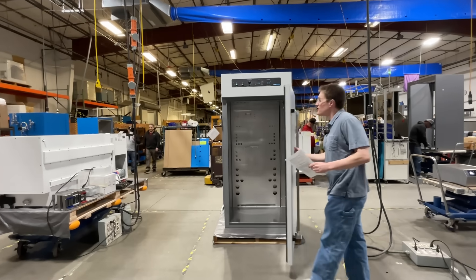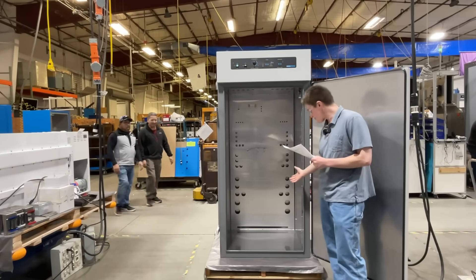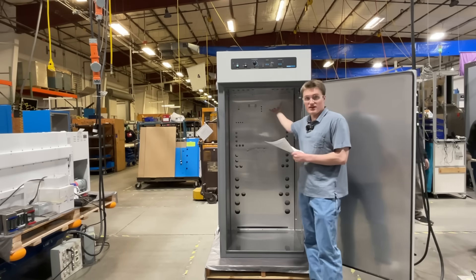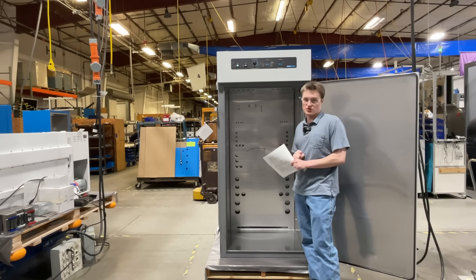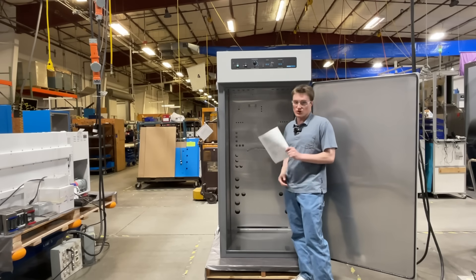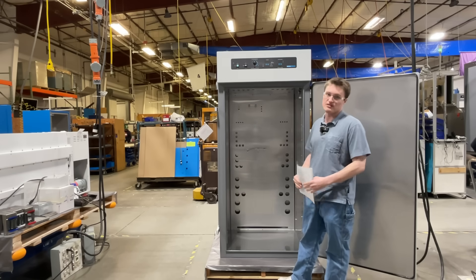As the name implies, the SMO28 features 28 cubic foot capacity. It uses a double gasket feature along with forced air convection to provide precise and uniform temperature control. Additionally, the unit is constructed out of stainless steel and other corrosion-resistant materials to prevent corrosion and increase longevity of the unit.